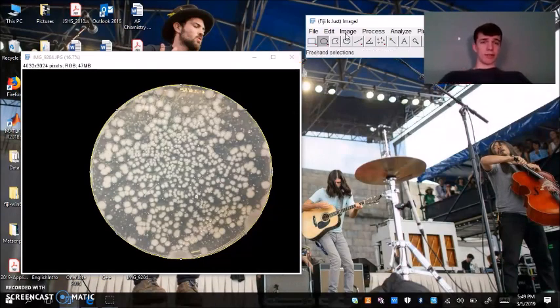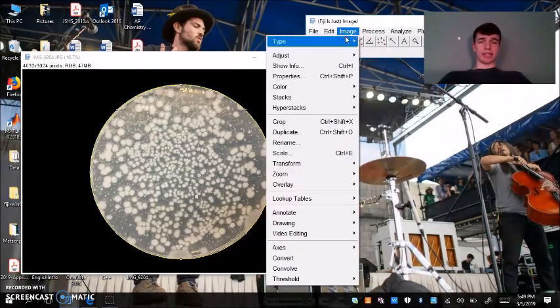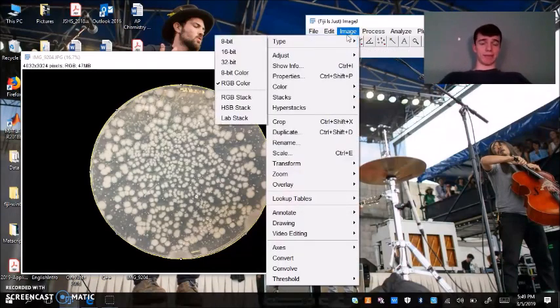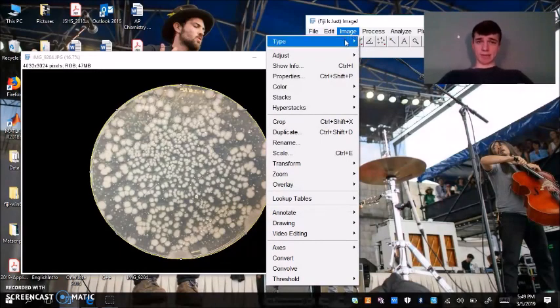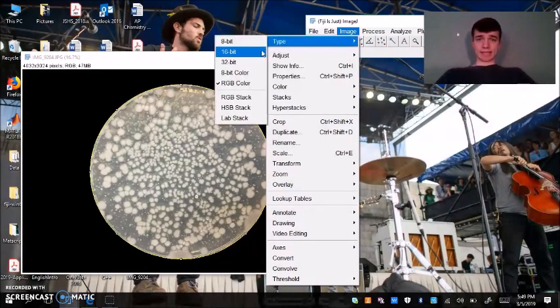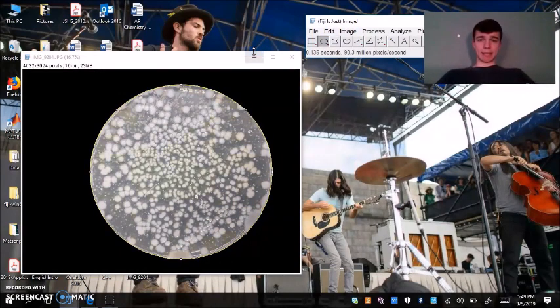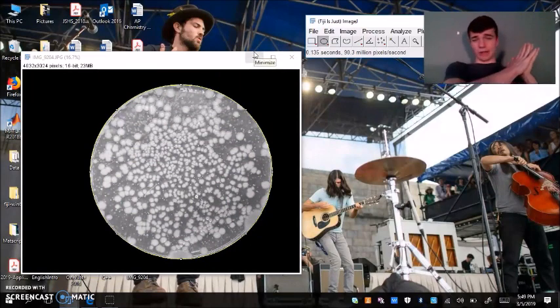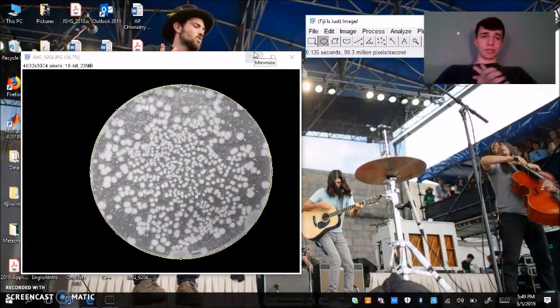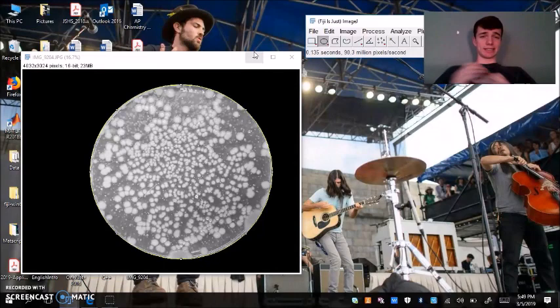Next, we're going to change the type of image. We're going to go to Image Type, 16-bit. That will convert our picture to grayscale, which will allow us to threshold it in the next step. And that will explain what thresholding is.